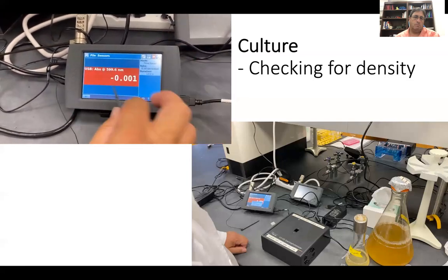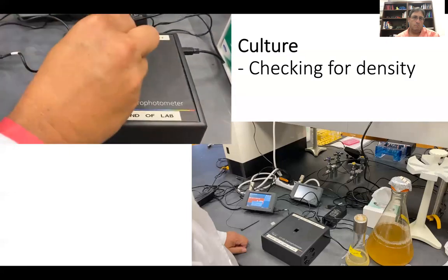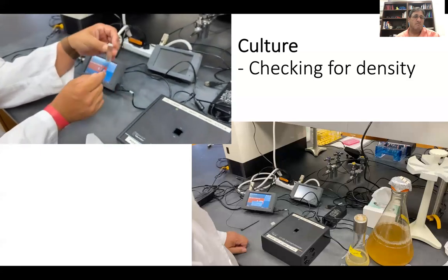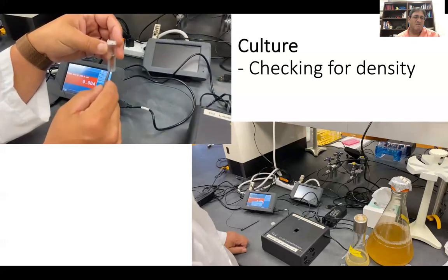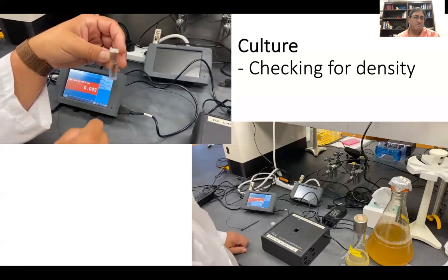If you leave this on at that 0, simply put in your new cuvette with about halfway filled. The light path, this instrument reads is sitting about here. So you want to be about this high with your solution. The light path will be a little beam of light going through the sample here, right about here. So you want to fill it up about halfway.